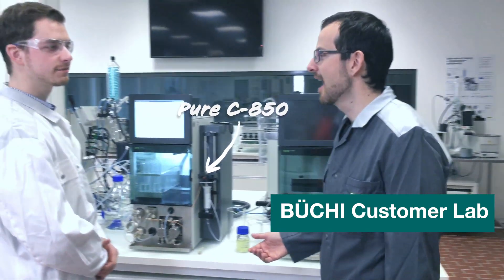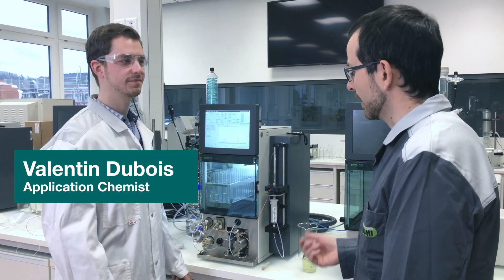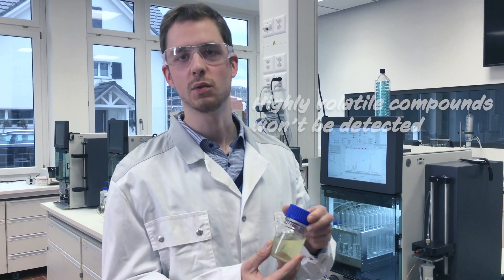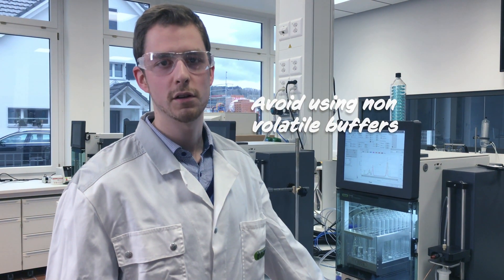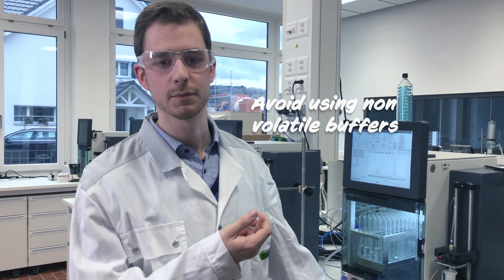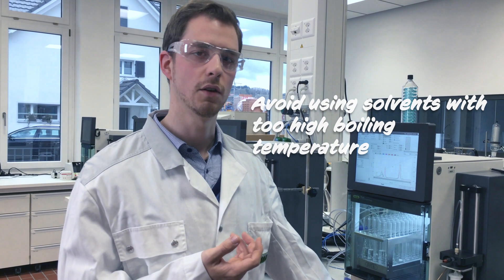Hey, Valentin. Hi. I'm sure you already had issues with your ELST signal. Sometimes, yes. Can you tell us what we can do from the application side to prevent these issues? If your sample is too highly volatile, it gets evaporated — with samples such as vanillin. Another problem is when you have a too noisy ELST signal, which means you are using a non-volatile buffer such as phosphate or citrate. In this case, you should go for formic acid or acetic acid instead. Or sometimes you are just using a mobile phase with too high a boiling temperature, such as DMSO, and you would also get a noisy ELST signal. Thank you very much for explaining.